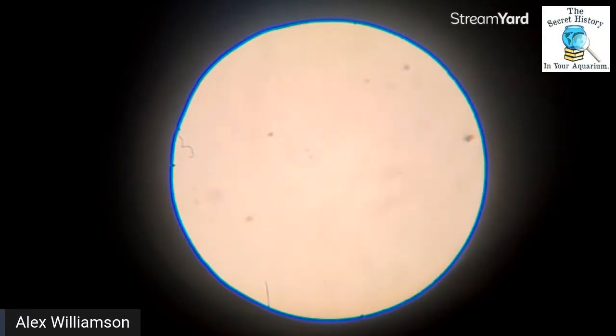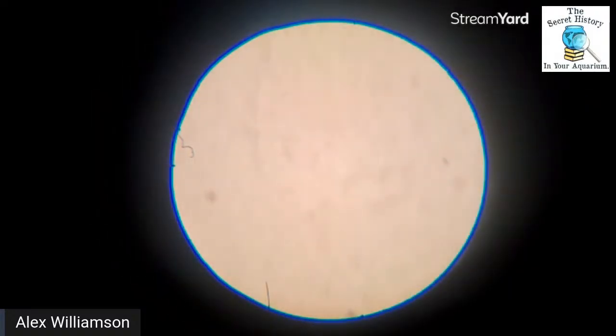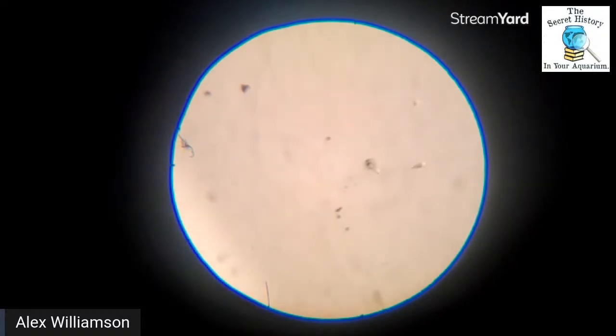Now we're at a level where if we sit still, we'll see little blurs come in and out, and then we might be able to pick a spot to go select. Or we could set aside some of the slides and put out food for them so that they would come in and feed, and then we'd have a spot to watch. It's hard without a grain of anything to focus on. We're looking literally at single cell organisms here, and these ones look dead.